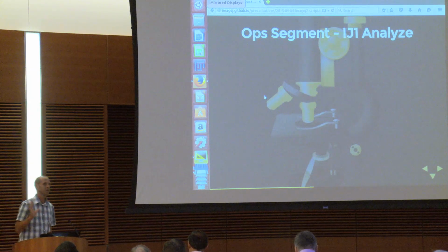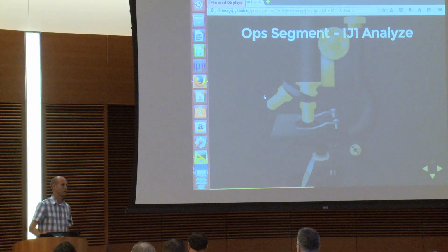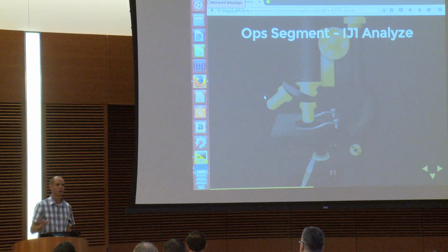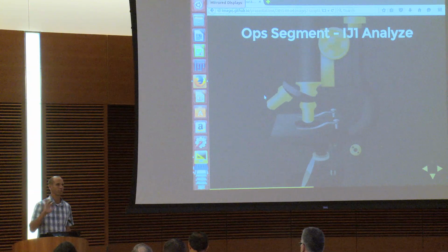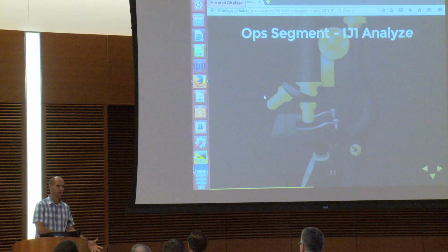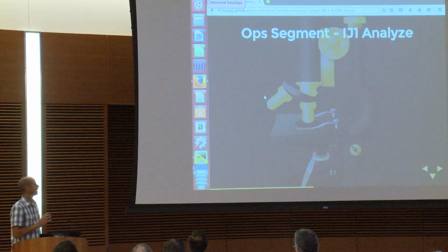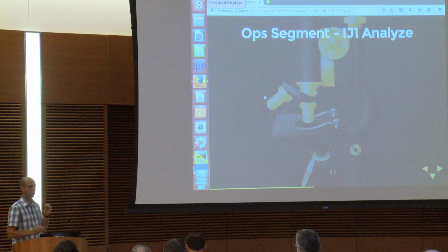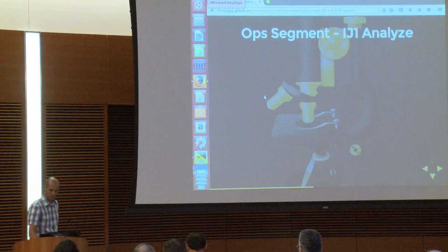However, I anticipate there always being cool IJ1 utilities that you'll always want to use. Even 5 or 10 years down the future, I bet there'll be stuff in IJ1 that you're going to say, oh, I've got this awesome ops script, but there's this one thing that's only in IJ1 and I want to integrate it. So this shows how to do that. Once you can perform an op, go back to the IJ1 world, and then you can do any kind of IJ1 macro commands that you'd like.